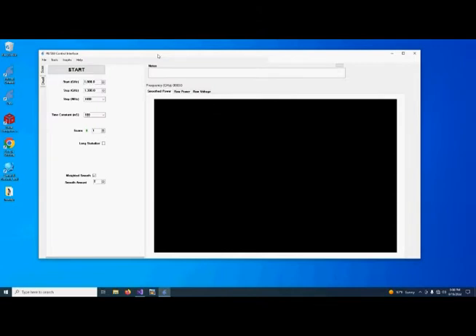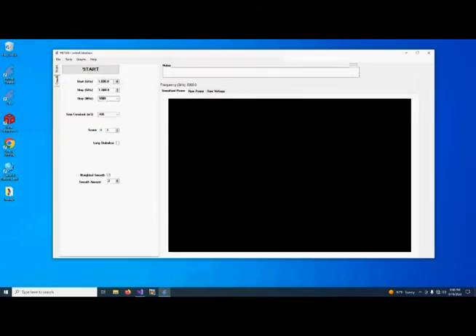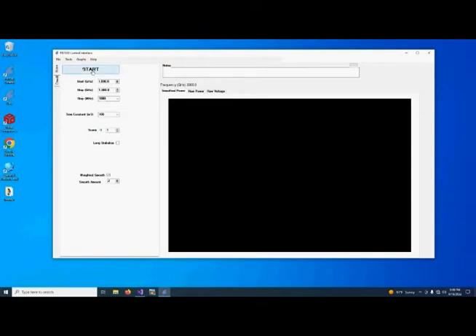We're going to scan from 1 terahertz to 1.3 terahertz. We're simply looking at the water vapor that's in the atmosphere here in the laboratory and about 10 centimeters of path length. So we'll start.